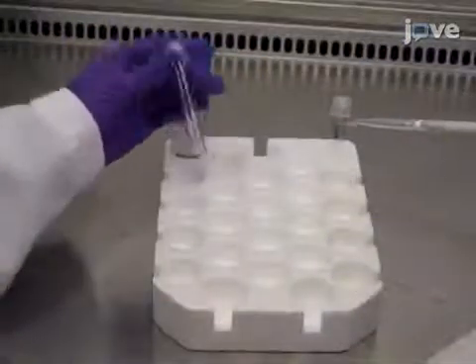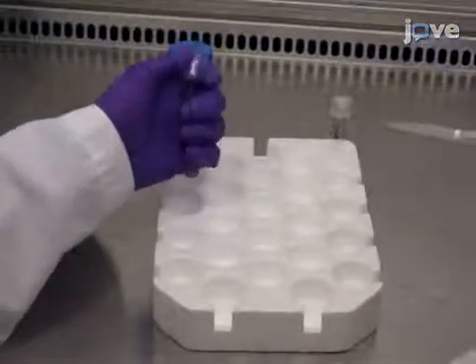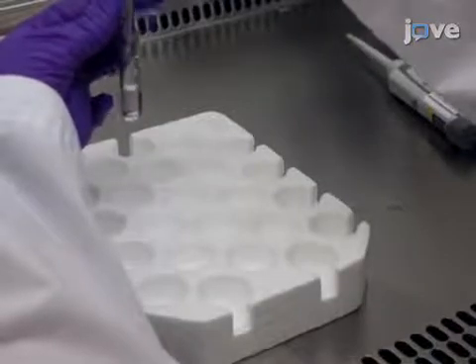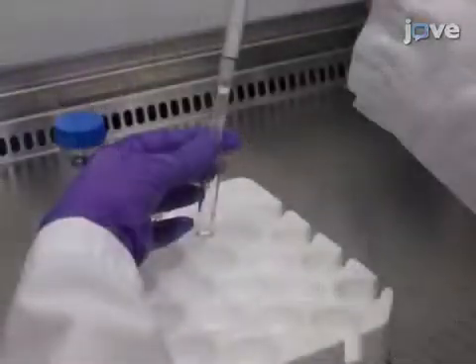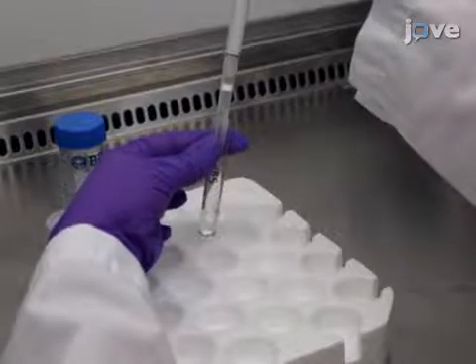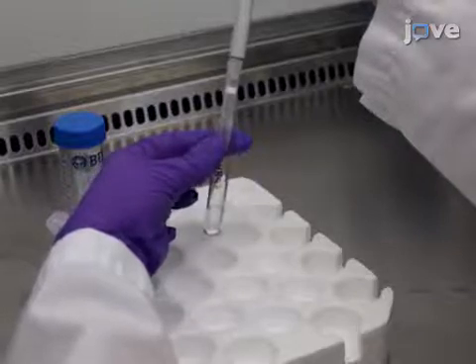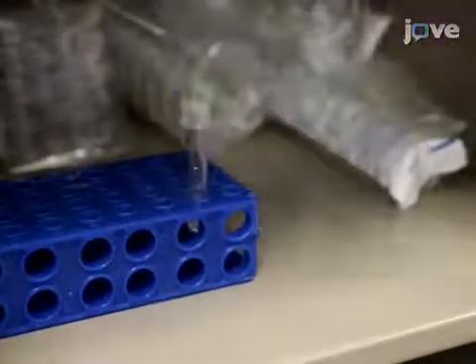After that, add 1 milliliter of 2xHBS to the tube labeled 2xHBS. Next, slowly add 1 milliliter of the contents from the DNA tube to the 2xHBS tube, one drop at a time. Continuously tap the 2xHBS tube and observe the calcium phosphate precipitate formed after each drop to ensure successful creation of the transfection complexes. Subsequently, incubate the tube in the dark for 30 minutes at room temperature.